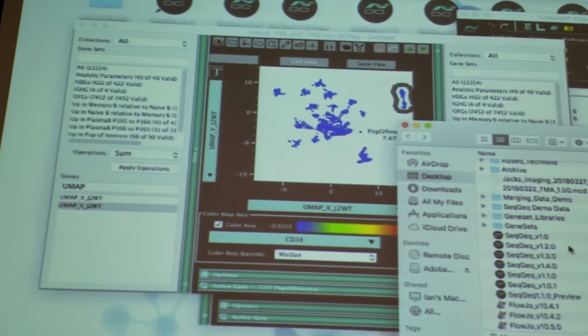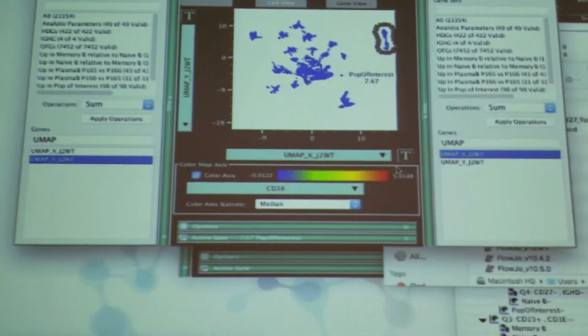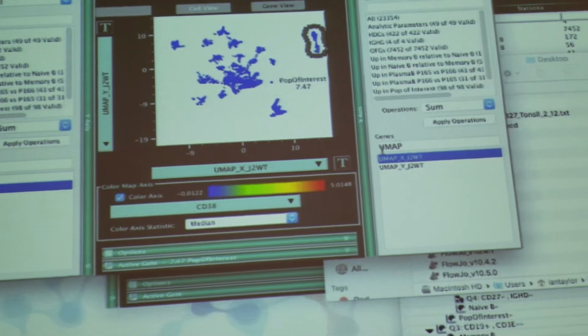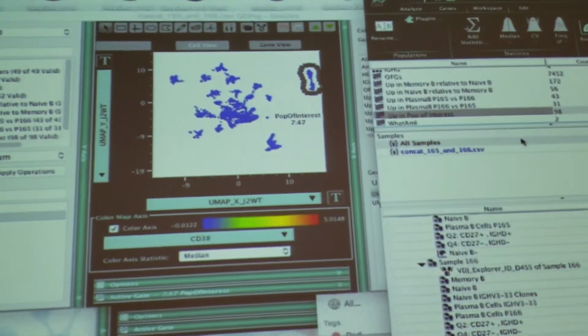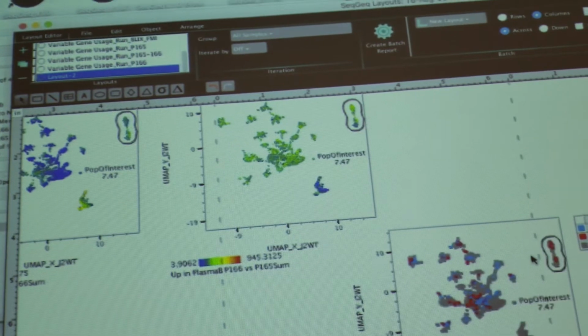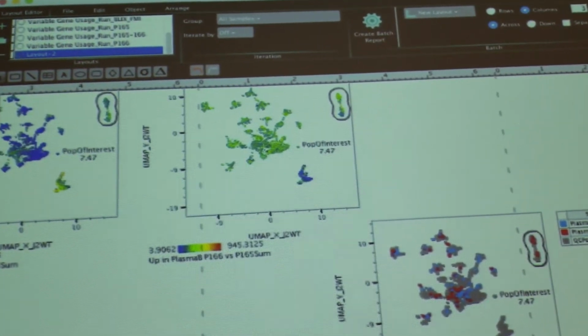That's right. But in this UMAP that you just put here, those are high in one. What are they? One high in 165 and not compared to 166, or what is that? Well, the way that we decided that population might be interesting was back here in the layout. We did an overlay of these two populations, and we said, okay, there are some number.